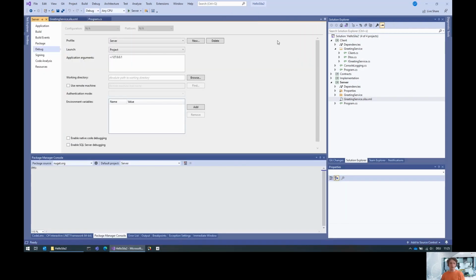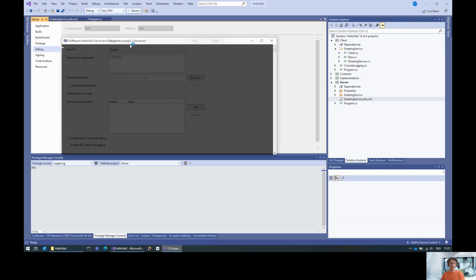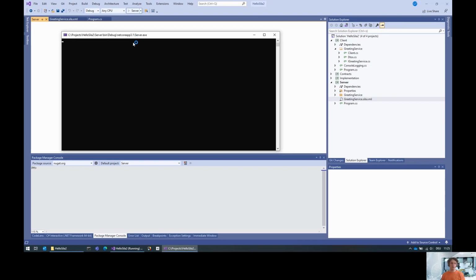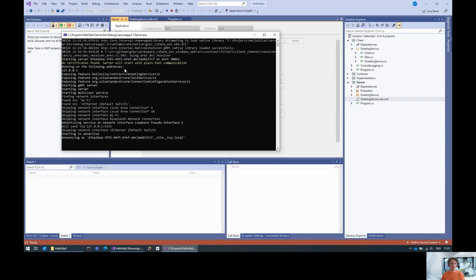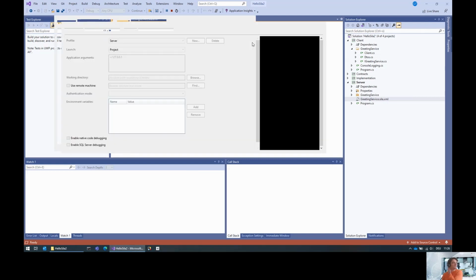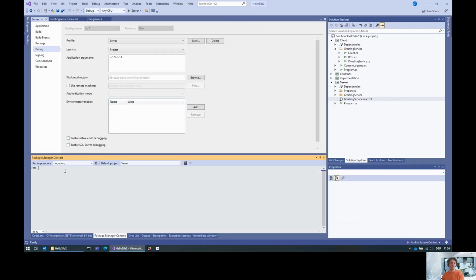How do you change that? For that, I forgot, you do need the UUID of the server. The server always uses the same UUID, unless there's no configuration, in which case a new ID is rolled, but we'll need that for the certificate. And to create a certificate, the SiLA 2 SDK comes with a specific command.